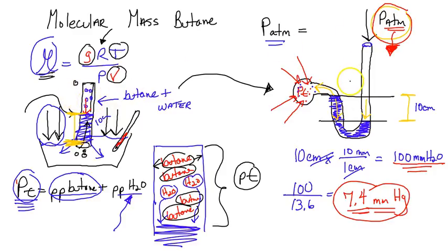So we're going to know this value. Whatever this value is, we're going to add 7.4 millimeters of mercury, or 7.4 torr. It's the same thing. Now the only problem is, I'm probably going to give you what they normally give at the weather station, in terms of inches of mercury suspended. Yeah, that's right. We still use the English system.